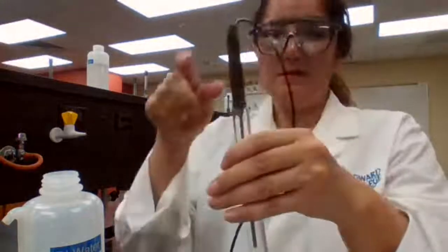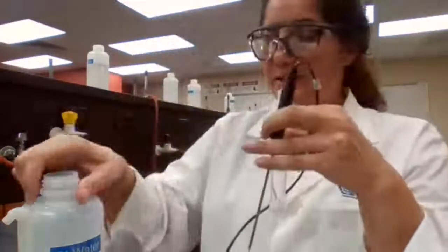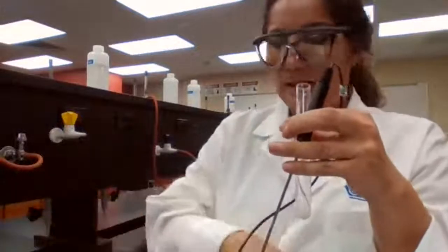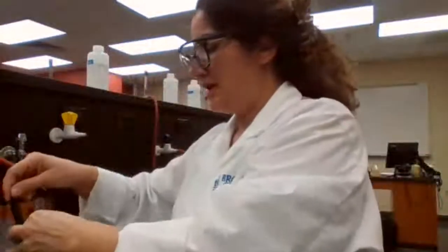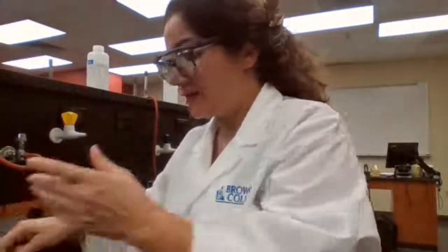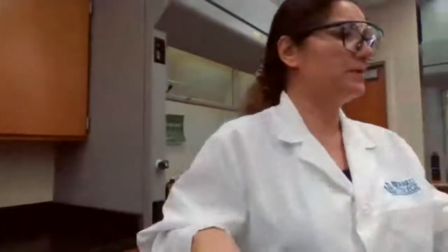What does it mean when you try to dissolve ammonium chloride in water? It cools down, the temperature is lowered. What type of reaction is that? Is that an exothermic or endothermic reaction? That's what you basically need to identify at this point. That should be your conclusion for this part of the experiment.